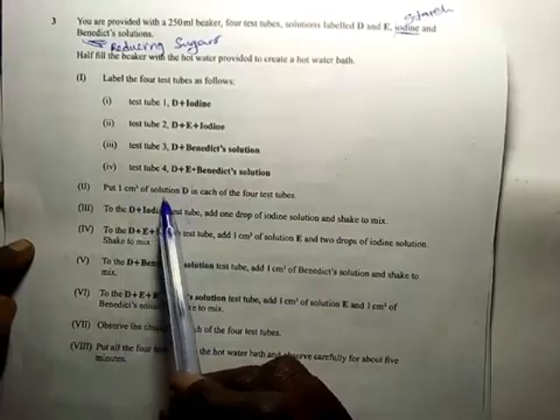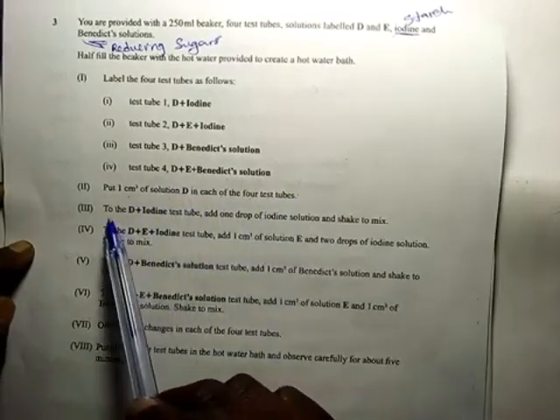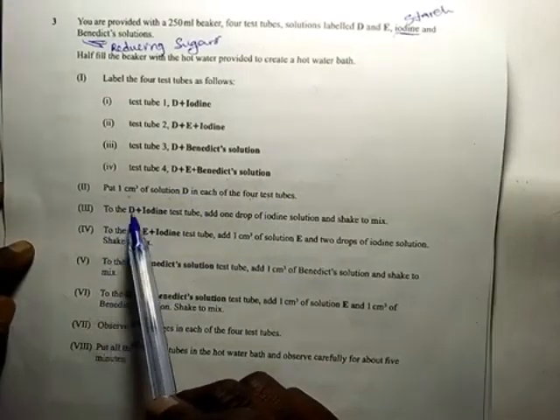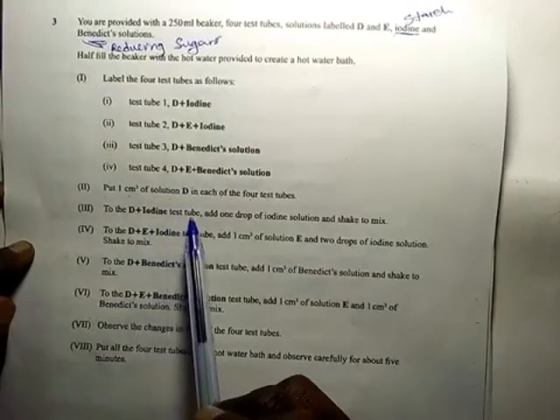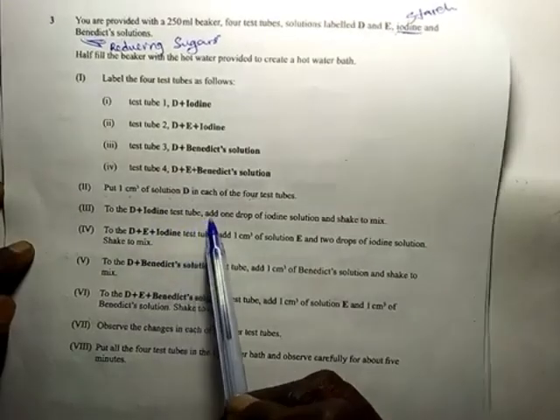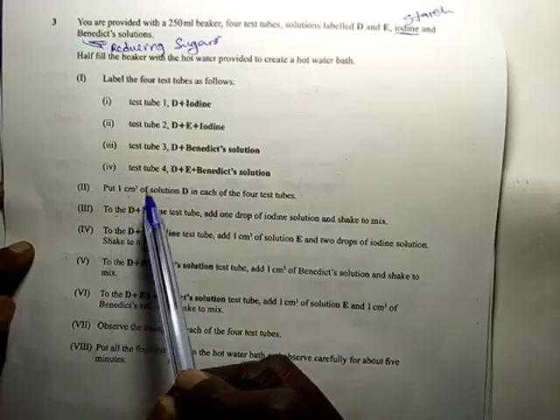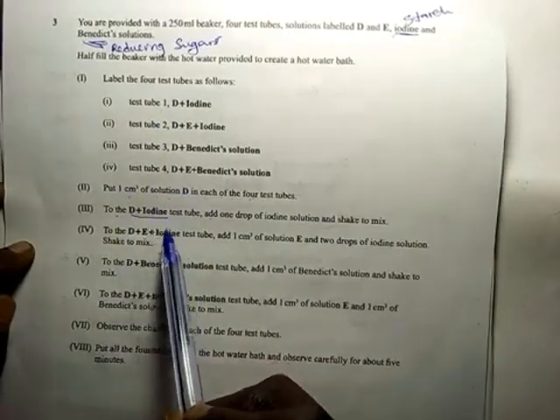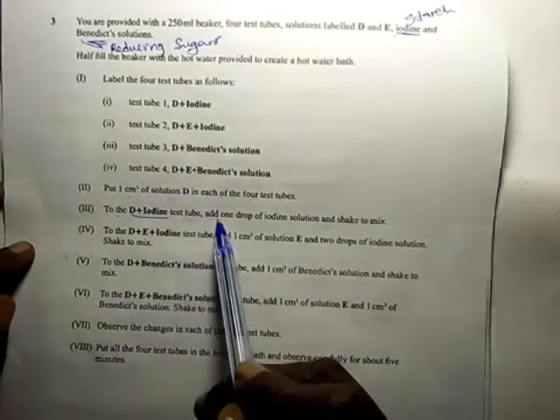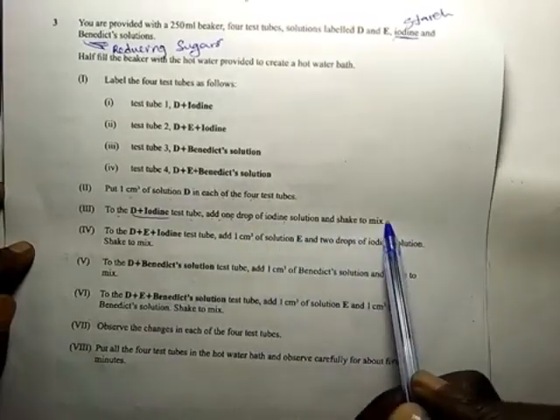In Roman 3, to the solution D and iodine test tube, add 1 drop of iodine solution. This means that you are in test tube 1, which you labeled D plus iodine. Add 1 drop of iodine solution and shake to mix.